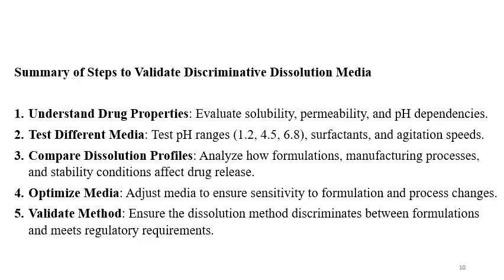So in summary, the discriminatory dissolution media development involves steps like understanding the drug properties, testing different medias, comparison of the dissolution profiles, then media optimization and validation of the method.